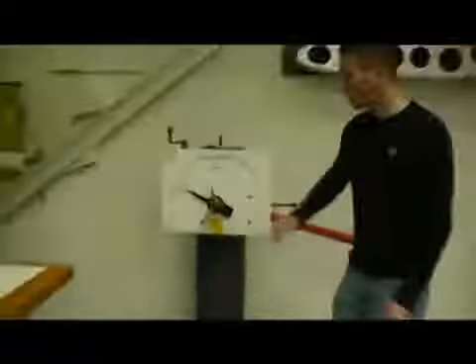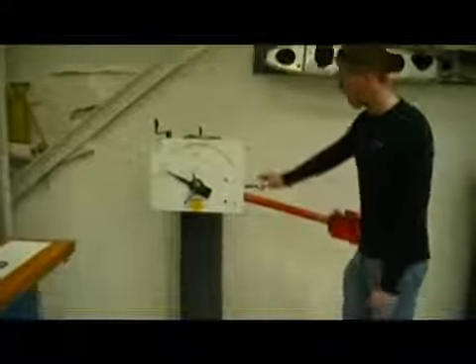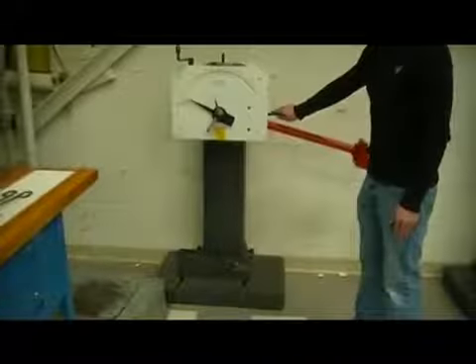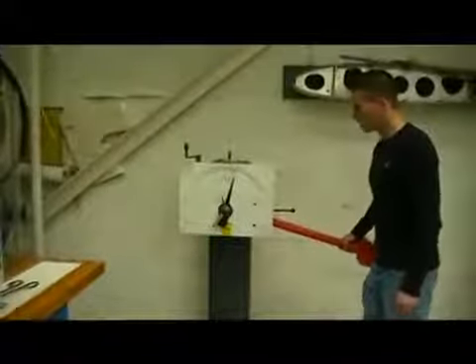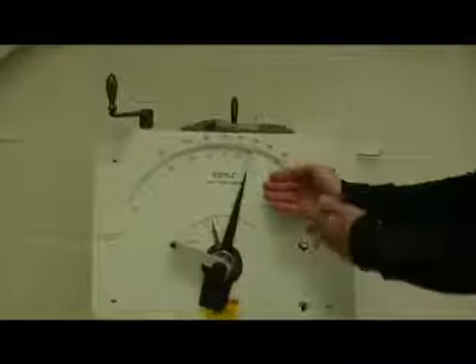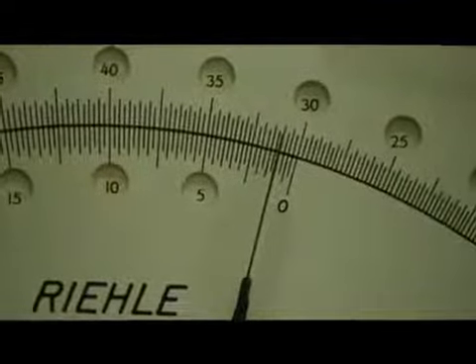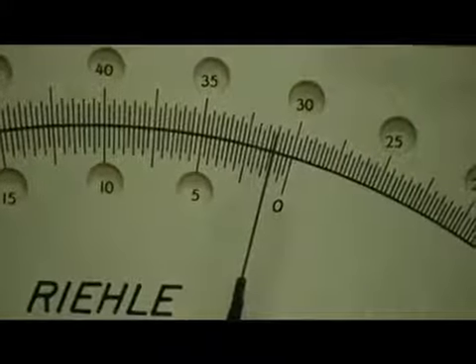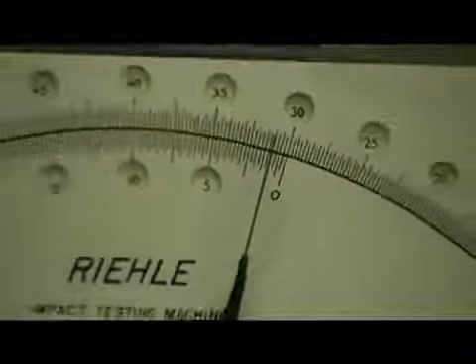With the dial placed past the end of the scale and the apparatus clear of any people, we can push the handle towards the wall with no sample in place to zero the machine. Catching the hammer and releasing it slowly back to the down position, we can see that the scale has returned almost all of our potential energy, which makes sense because there was no sample there to absorb any of that impact. Looking at where the scale stopped, that is our new 0 point, and all of our measurements in the future should be taken from that 0 point rather than the actual physical zero of the scale.